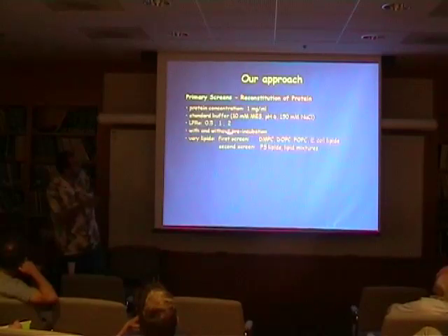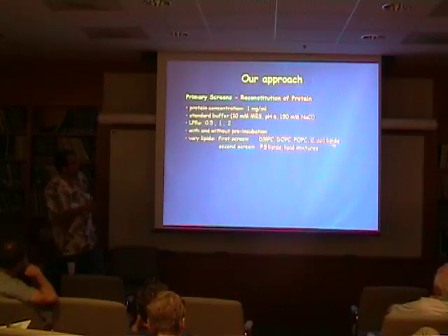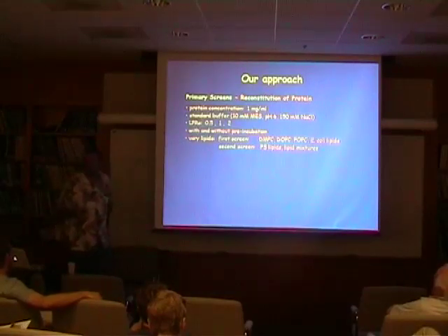And then what we really vary the first time is the lipid itself. And what was interesting to me is that the lipids that we actually use to try are obviously also the ones that are most successful. So we always try these 4 lipids first. If they don't reconstitute the protein, then what you can try is to pre-incubate with these lipids overnight and then start the dialysis the next day. And if these lipids don't work, then we try other lipids, so phosphatidylserines obviously sometimes are successful, or also lipid mixtures to give the protein as much chance as possible to get the lipid that it wants.